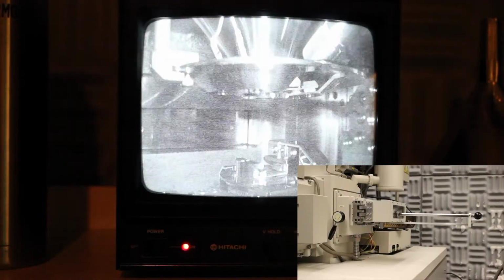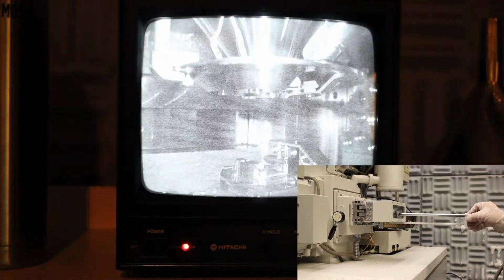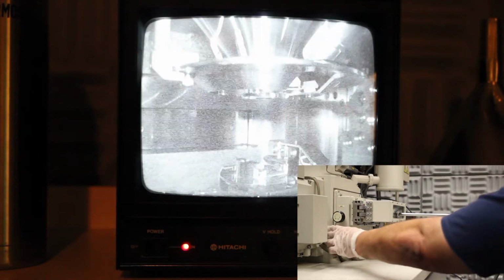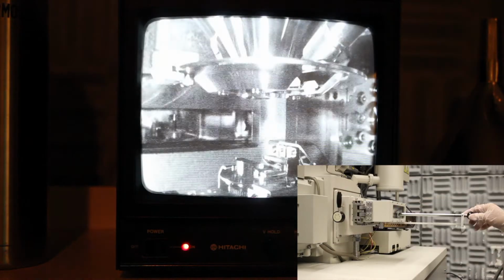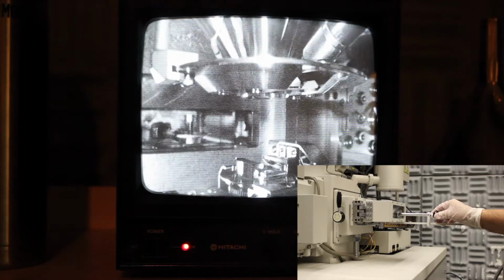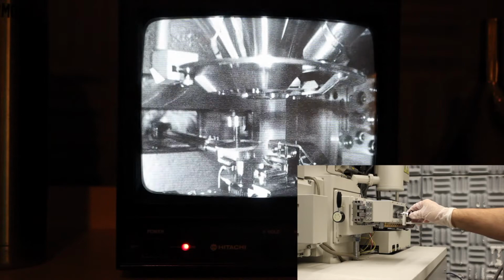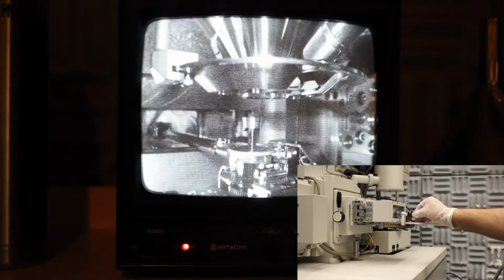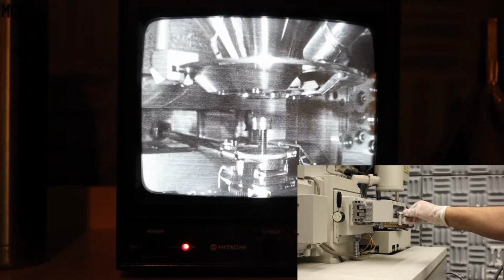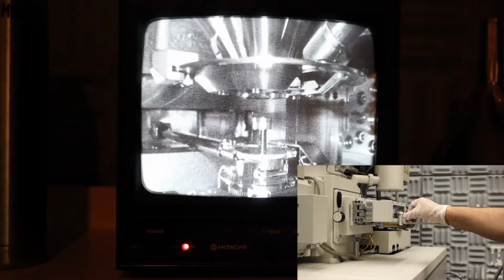Once the specimen exchange chamber pressure is at 2 Pascal, you slightly unlock the exchange rod and hold it in position. You then open the manual valve and slowly push in the holder while looking at the monitor. When you get to the stage itself, just give it a little push and then you can unwind the exchange rod screw so that we can release the sample holder on the stage.